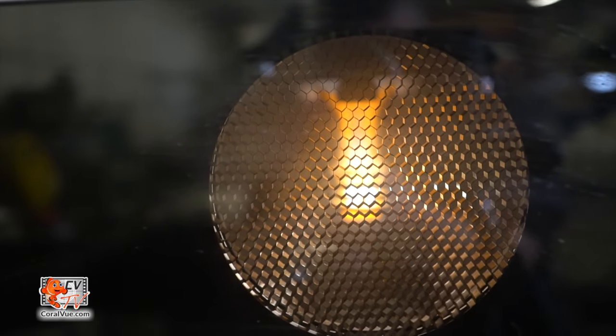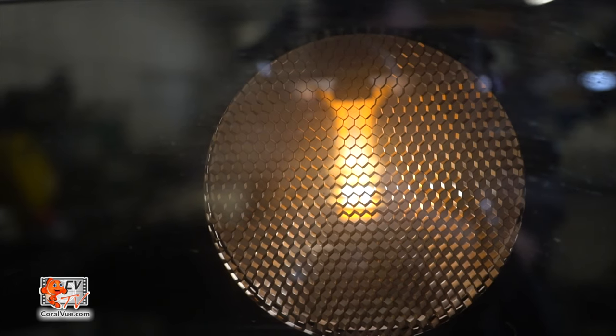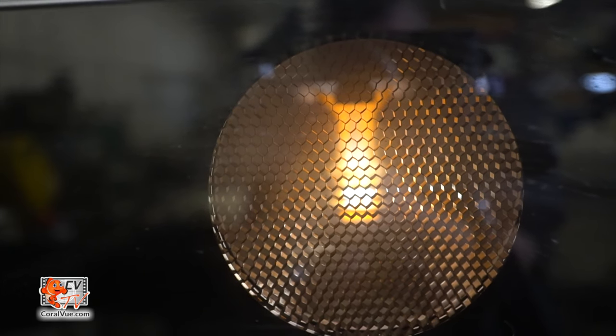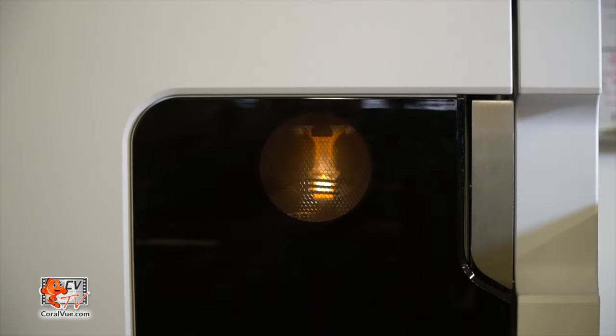...a plasma is created that can reach temperatures between 7,000 and 10,000 degrees Celsius, well above the temperature of the surface of the sun.